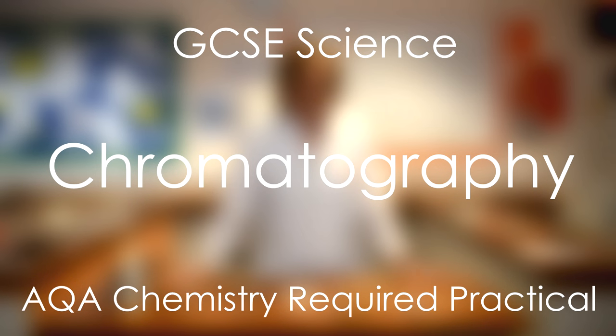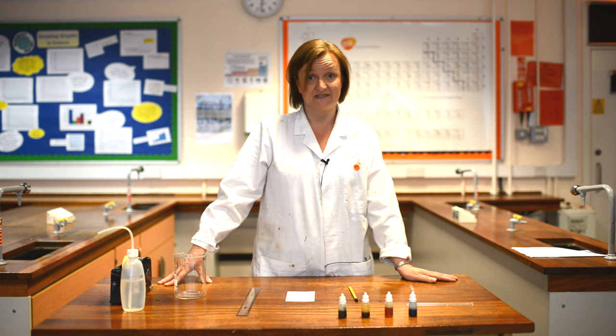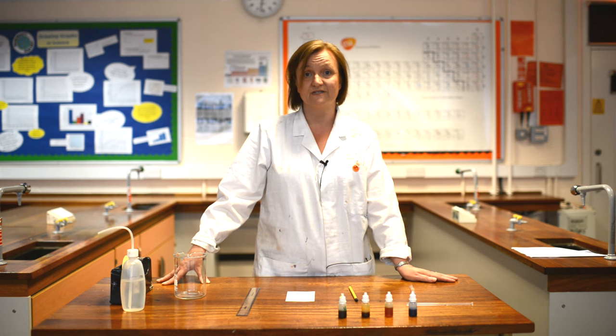This practical we're going to look at today is chromatography, and chromatography literally means color writing. It's a separation technique used to separate materials in a mixture.